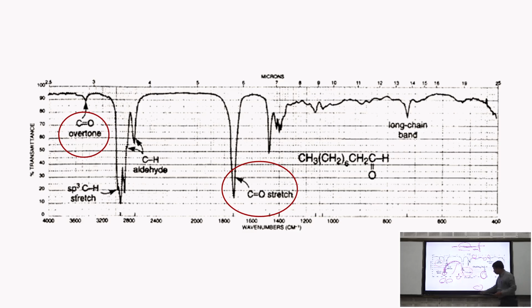So this is the carbonyl band, and this is the fundamental absorption band.